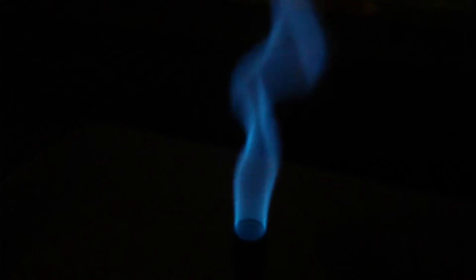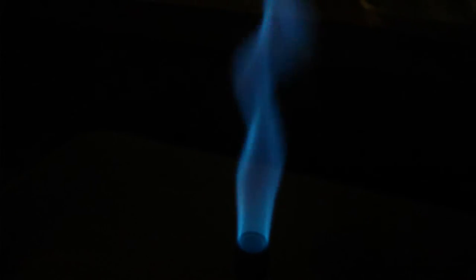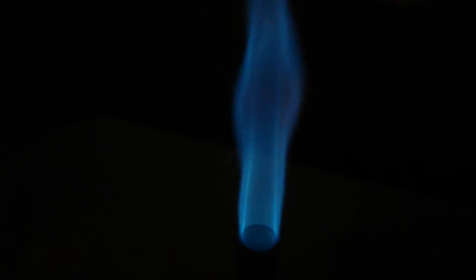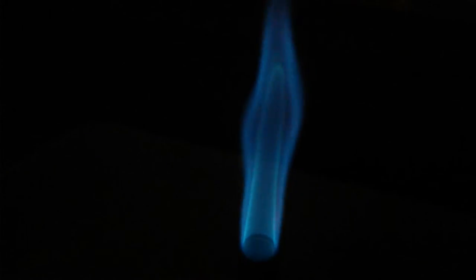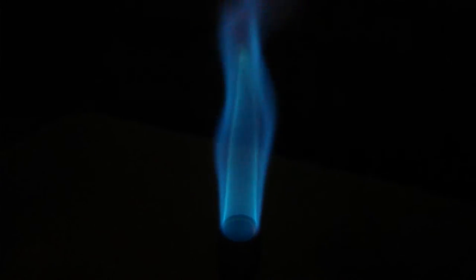If you open at the base of the Bunsen burner, the opening, so it receives more oxygen, you see how it turns bluer and the thing that you want when you are flaming your loop is this flame that is blue.